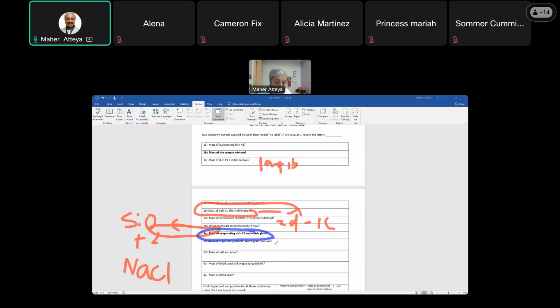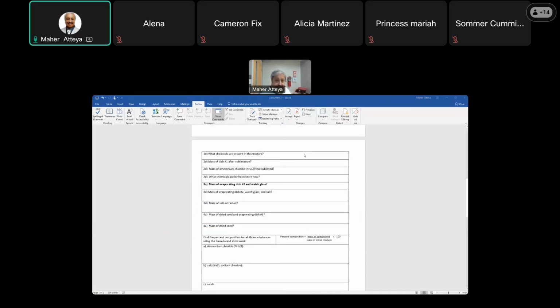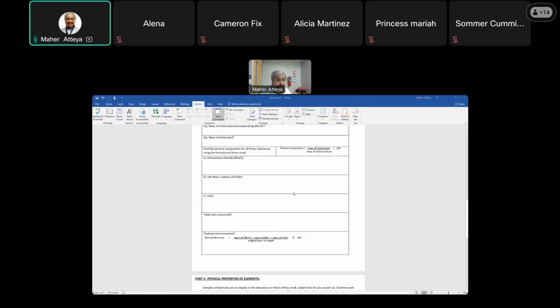Now, you'll come down, all the way down here. Let me just take this one here. Come all the way down here. That's where you calculate the recovery.